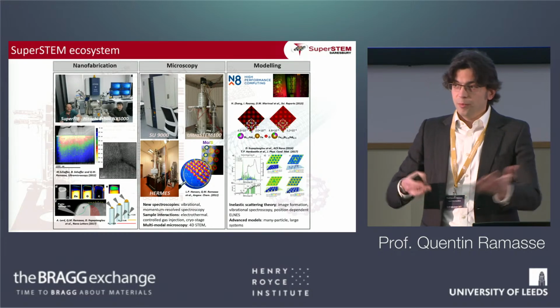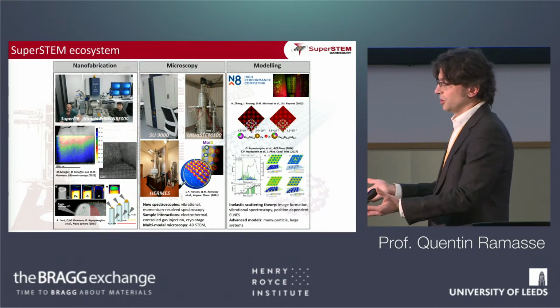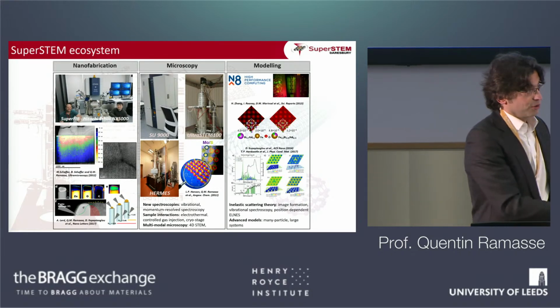Maybe this is something that all microscopists are guilty of. They show you some wonderful images and some wonderful results, and they forget to say, oh, by the way, this is very specific to these two or three samples. So it's not necessarily true of all the samples in the world.